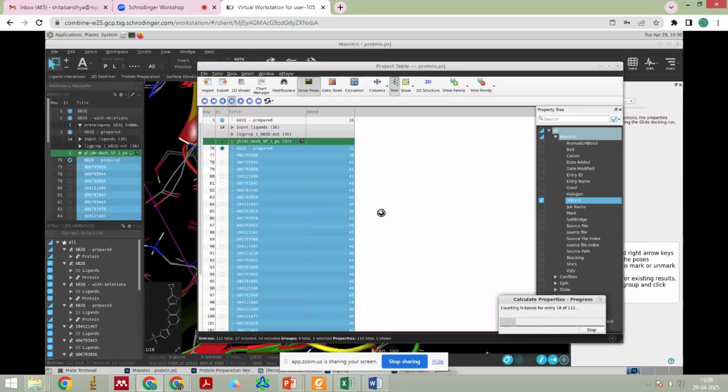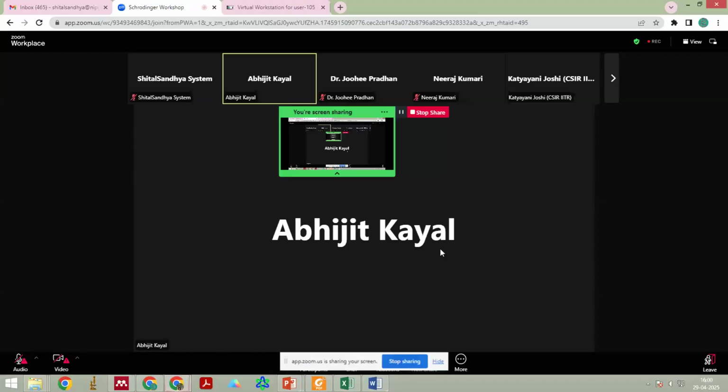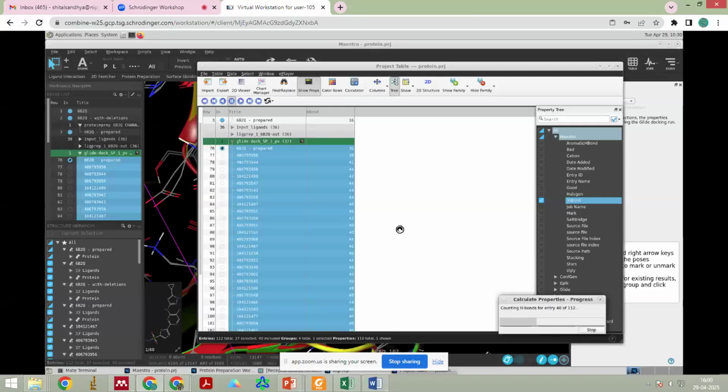Wait, it will come. Yeah, you stop sharing. No, I want to check that the values are coming or not. Sital, go to project table. Just wait. It will come from 76, right? The 76 entry is the docking result. Just wait.